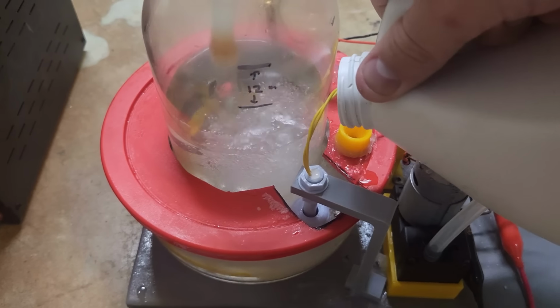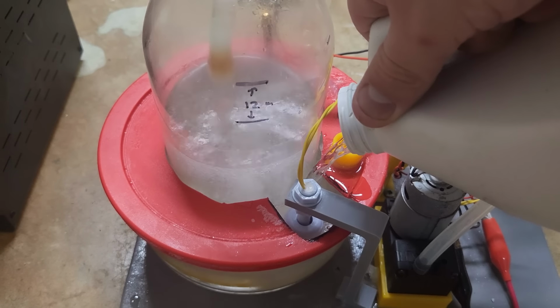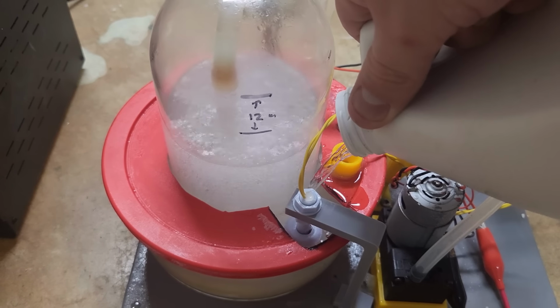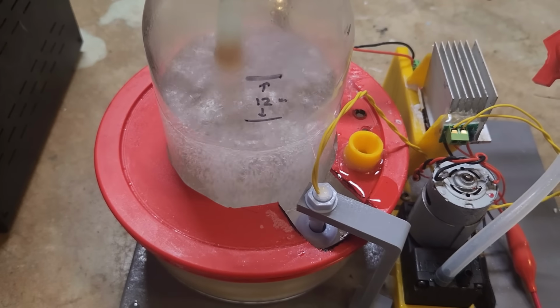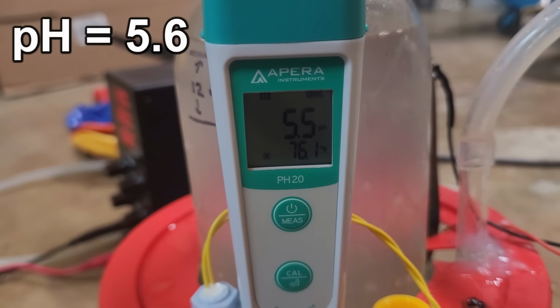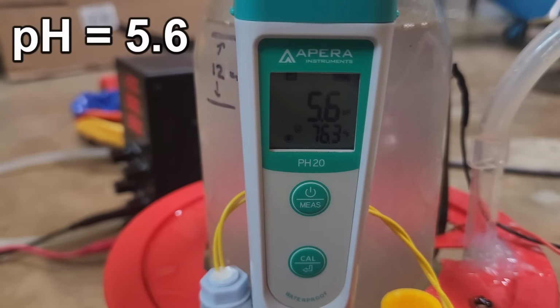I quickly rectified this by pouring a generous amount of 45% vinegar into the cell, and you can see the dramatic bubbling that occurs as CO2 gas is released from the sodium carbonate, or bicarbonate, or whatever it is. This brought the cell back down to its original pH of 5.6, but I feel like that's too close to being neutral, so I probably want to be somewhere between 3 to 4 just to make sure I have a really big excess of acetic acid.